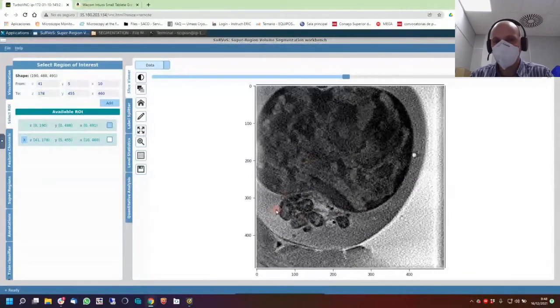So let's try to figure that out. If we go for these coordinates in X, we are going to see it is about 45. Now in X, we are going to go to 45. In Y, we are going to define 260 in this case, more or less. And in Y it is 270. But for us, you can say, for training purposes.